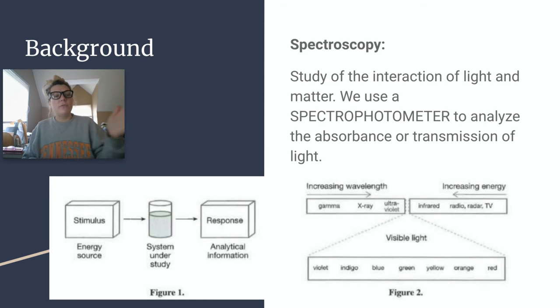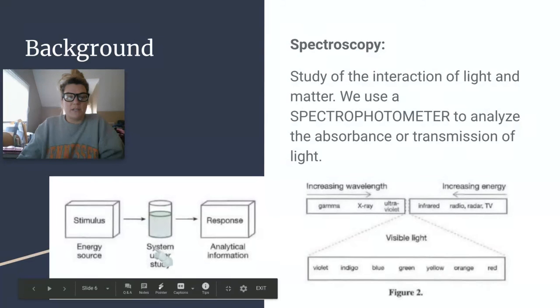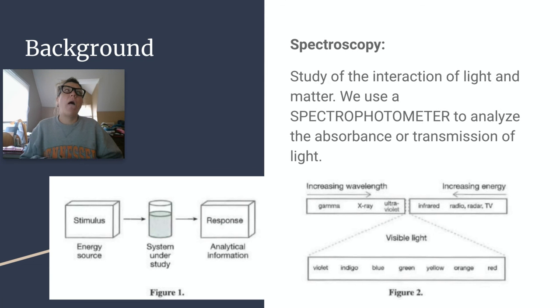However much light can go through is going to ultimately give us the response that we want. Now, we need to realize that light is on our visible light spectrum, on the electromagnetic spectrum, and we'll talk more about that when we get into the idea of color.